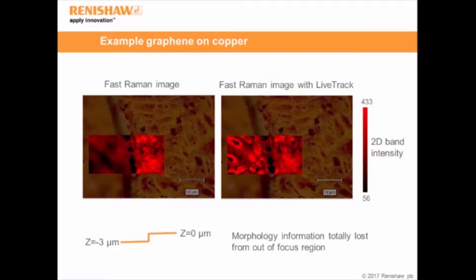The image on the right shows the same area — in fact the same scan — conducted with LiveTrack on. Here you can see that because we're able to track the surface, we get good intensity for both regions and we also recover all the morphology information that was lost. This really gives us much better control over what we measure and ensures that we get the best performance and the best results from our samples.